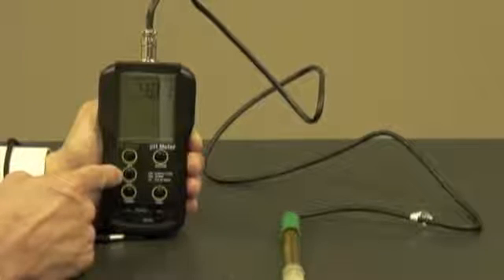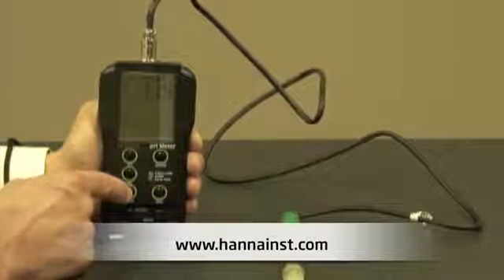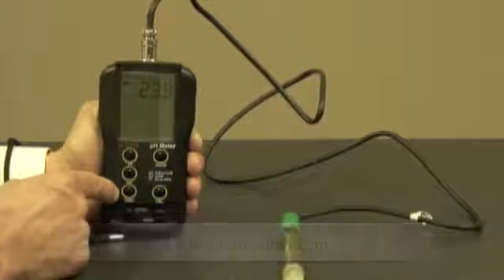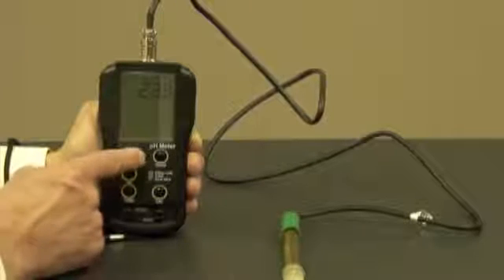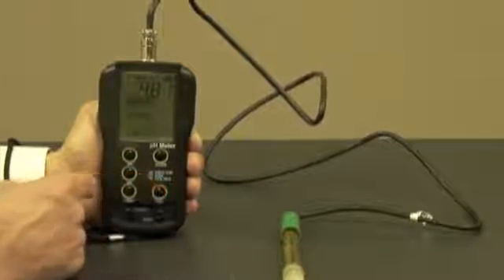If I want to see the pH reading in millivolts and or connect an ORP probe, I simply hit the millivolt button to see that reading. If I want to see the temperature, I hit the temperature button, which displays in degrees C. And when I'm ready to calibrate, I hit the pH button and go right into calibration mode.